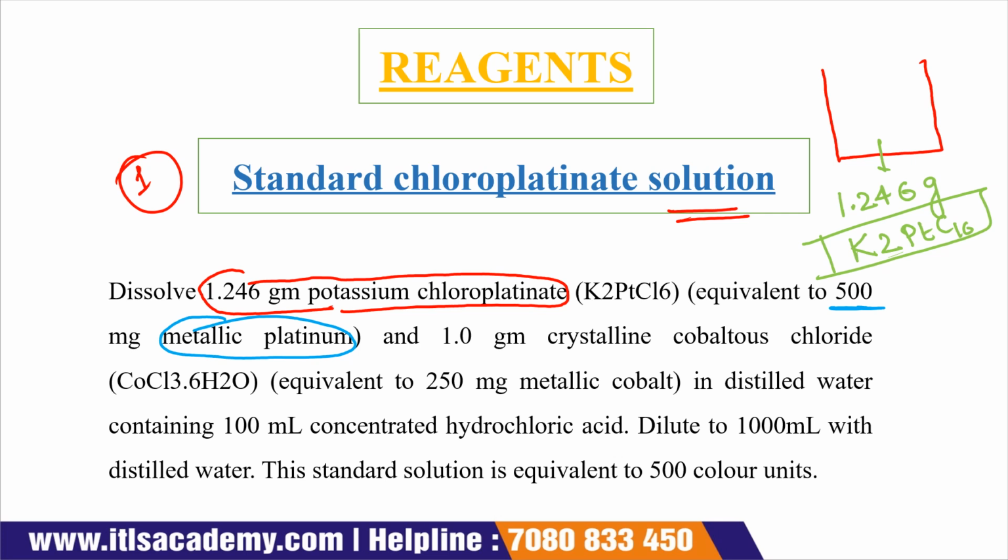After that, we take 1 gram of crystalline cobaltous chloride.